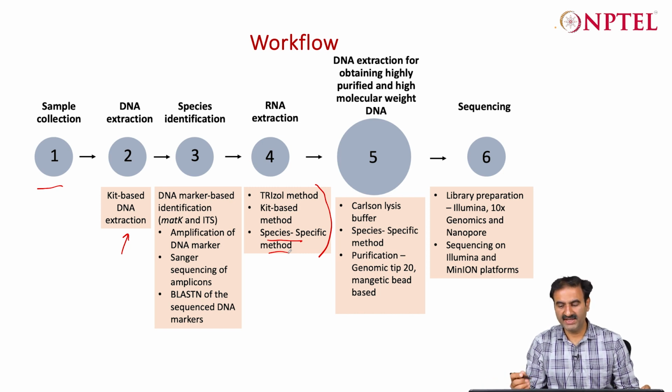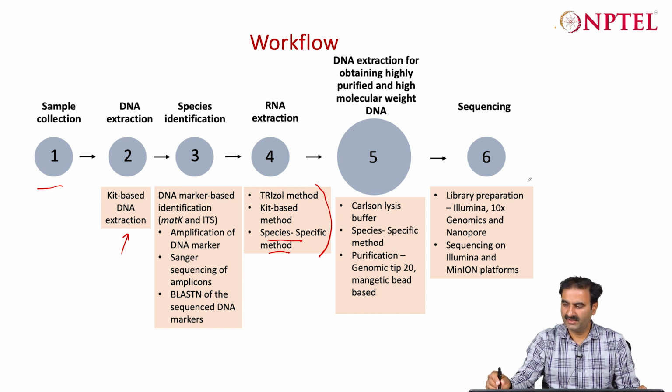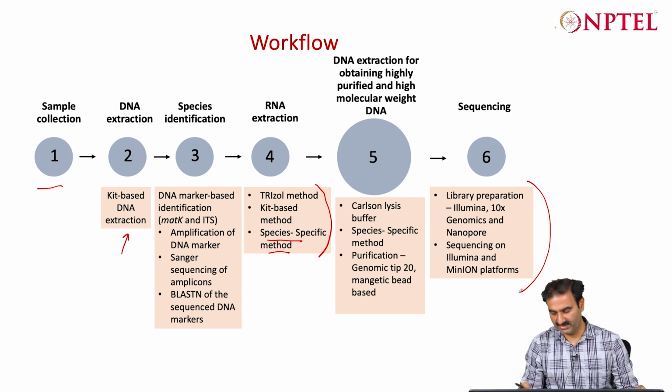Then for DNA extraction, high molecular weight DNA is often needed for long read sequencing. It is also good for short read sequencing, and for Hi-C, which helps you construct complete chromosomal level assemblies, followed by the appropriate sequencing method.